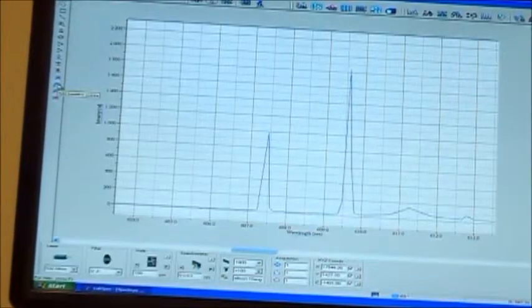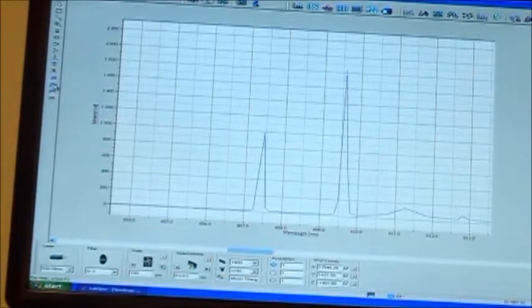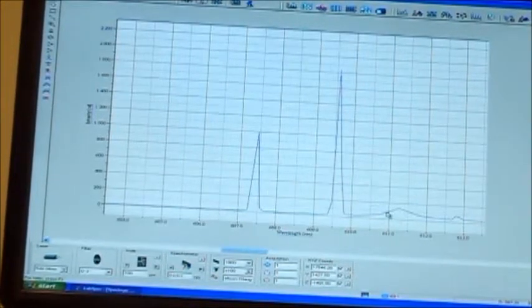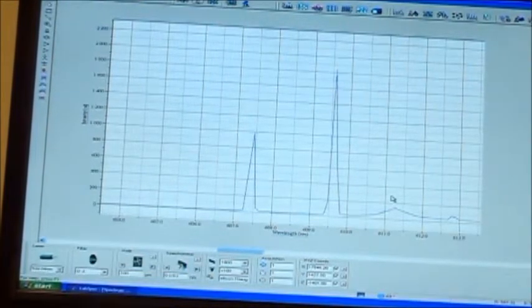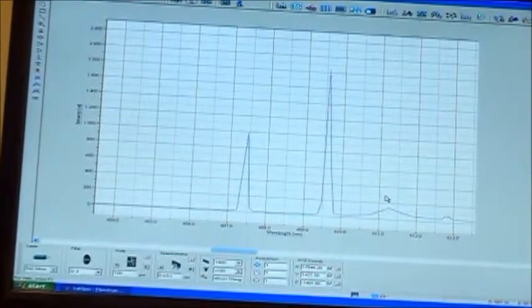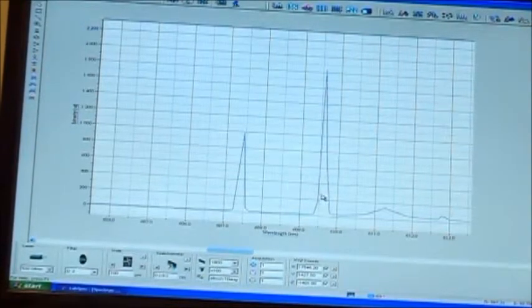Next one down is baseline points. The software can automatically do a baseline adjustment for things with a big baseline or high fluorescence. But if you have some kind of little hump of a peak that's not really a big strong peak, if you use the automated software in the program, there's a high probability that the software will actually remove this low broad hump from your data, thinking that it is just stray light or fluorescence.